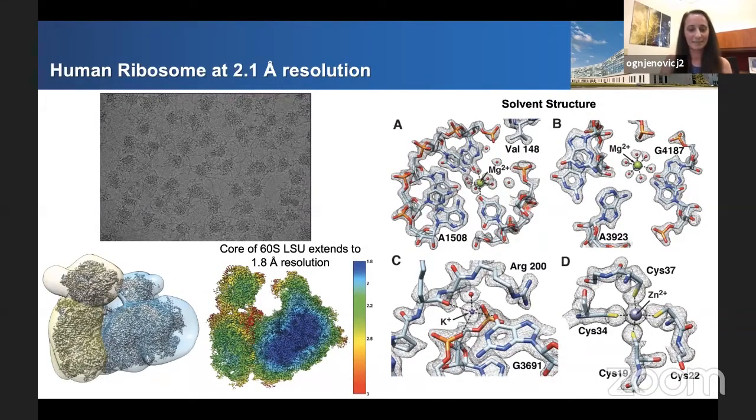And it's especially timely right now, where I hope that all of you who got their mRNA vaccines, their ribosomes are happily producing enough spike proteins to keep you happy. So for this experiment, we actually purified human ribosome, unstalled human ribosome, directly from HeLa cells. And here's a representative micrograph where you can see recognizable ribosome particles. And those strings surrounding particles, they are actually mRNAs that were caught inside the ribosome at the moment of plunge freezing during the grid preparation procedure.